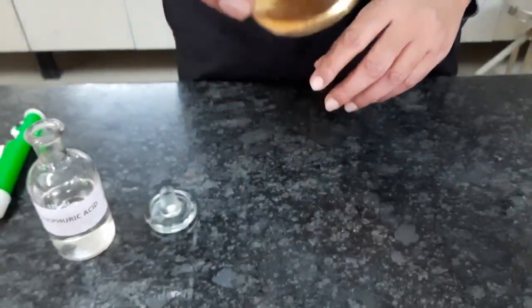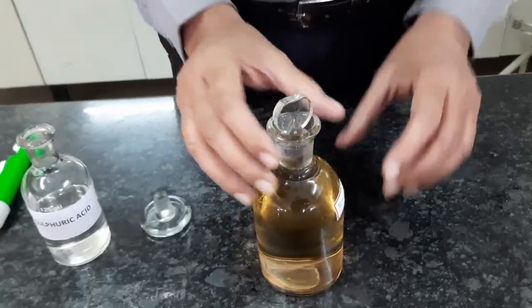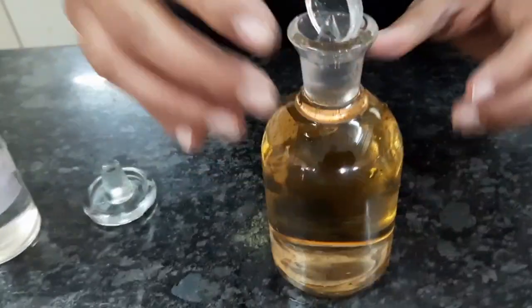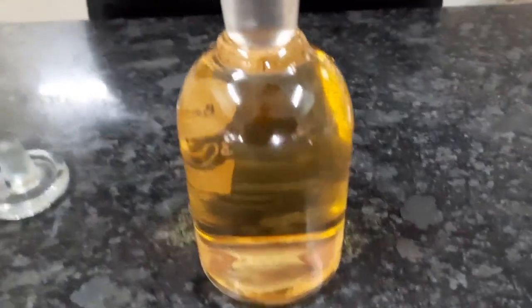And ensure that the water becomes clear, or the whole precipitate is dissolved. If the precipitate is not completely dissolved, you can add a little more of the acid to ensure the complete dissolution of the precipitate.